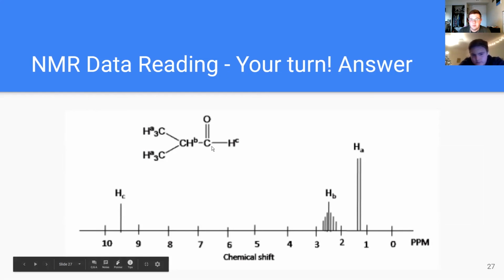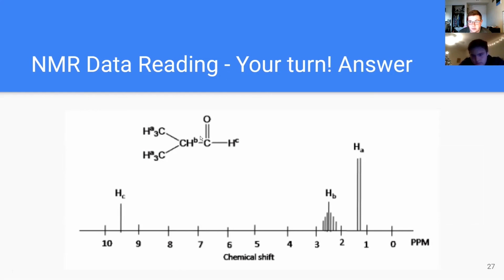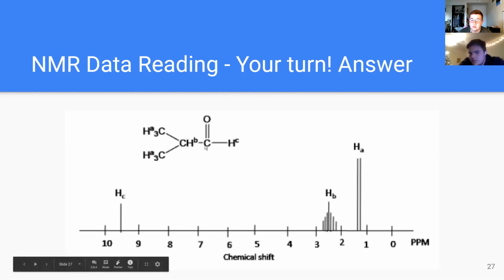And you can see that this functional group right here isn't counted or recognized at all, because like we were saying, the NMR in this stage only cares about hydrogens. And so this is more or less invisible to it. But excellent work.